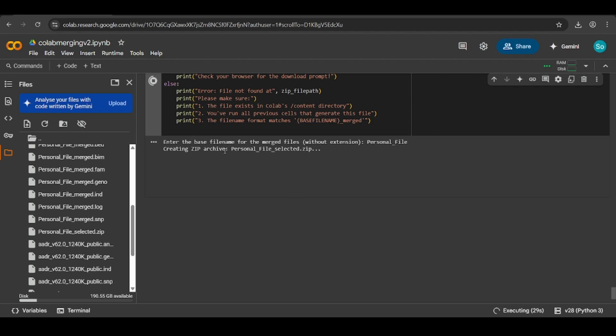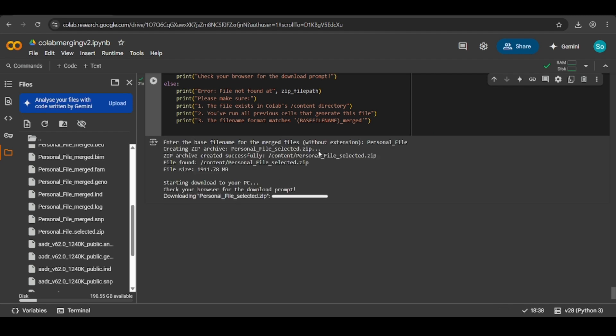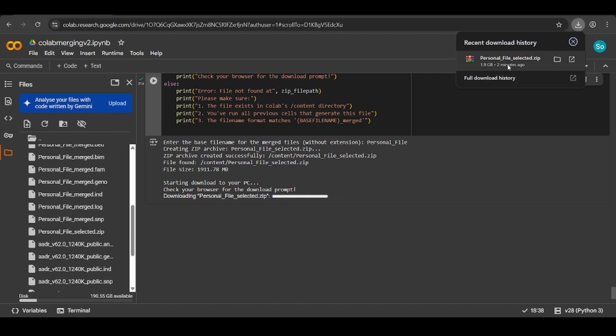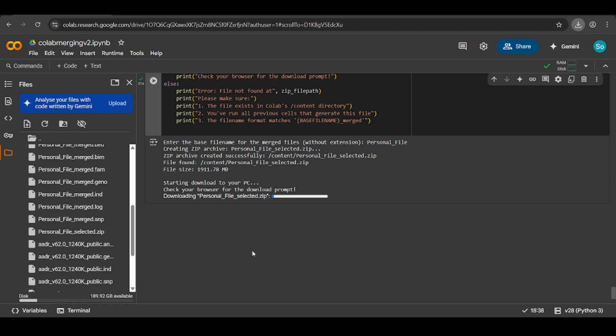Then it will create the zip archive and then it will let you download it. After this has finished loading, it will download here and then you'll get the personal file in your computer. That will be the conclusion of this tutorial. Then the next tutorial will show you how to use this file and use it to run qpAdm models on yourself and on other files in a dataset.